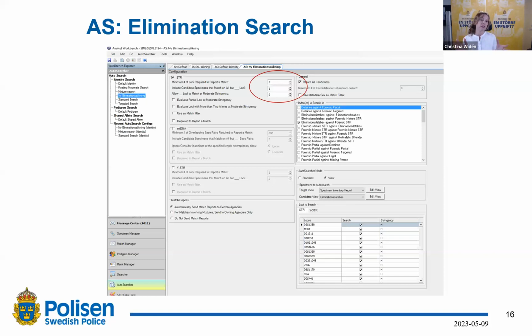So we analyze 15 marker loci. We are starting now to turn to fusion, so we will have profiles with more information, 23, I think. We have started with our reference samples, and in the autumn we will start analyzing stains with this new fusion kit. But right now, to be able to enter a stain into CODIS, we need at least 5 markers to include a profile in CODIS, and that is not so many.